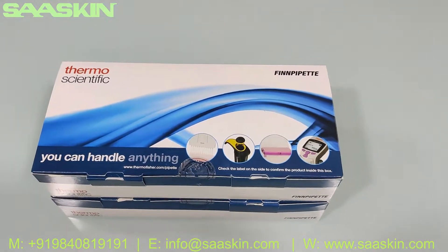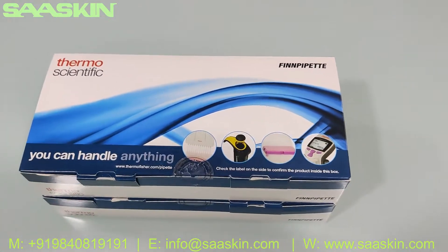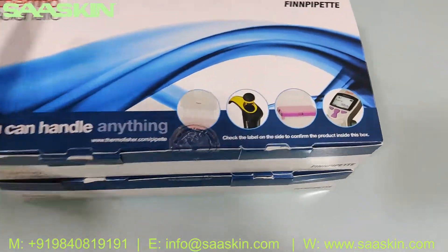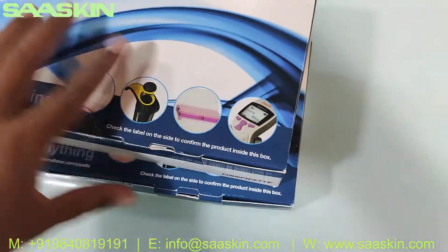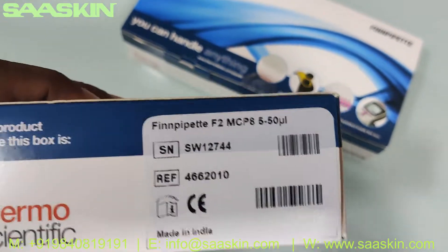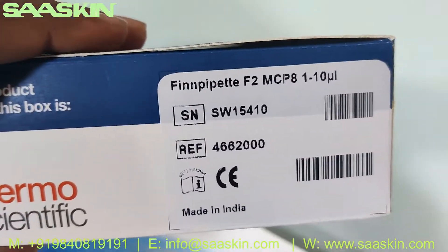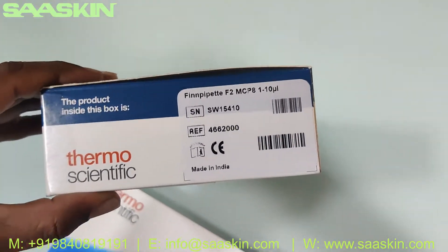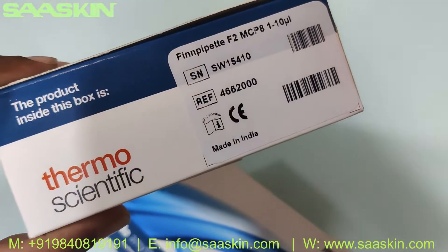Today I'm going to introduce the Thermo Scientific multi-channel fine pipette. I have two boxes here showing two ranges: 5 to 50 µL and 1 to 10 µL. This is the Thermo Fisher fine pipette F2 multi-channel model — available in 1 to 10 µL and 5 to 50 µL — and this is an e-certified product.